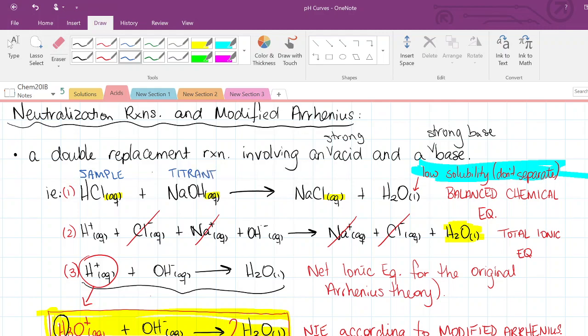And so you guys saw that the first data point had a very, very low pH, and we were adding strong base to it. At equivalence, at the point at which the pH is 7, all we will have in solution is water, and sodium ions and chloride ions will be in there. They're spectator ions, but all we'll have in there is basically water.